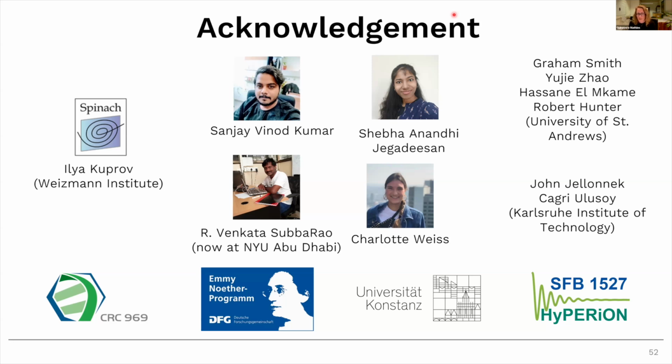But I think it's definitely worth going in that direction more, looking also at what you can do with transition metals or the f-block elements, the lanthanides also. Because those are also polarizing agents that you can use under conditions where you can't use an organic radical, and those are also the ones you cannot really excite very efficiently with CW-DNP. So that's definitely the direction we're thinking about, to develop pulse sequences, especially for these polarizing agents.